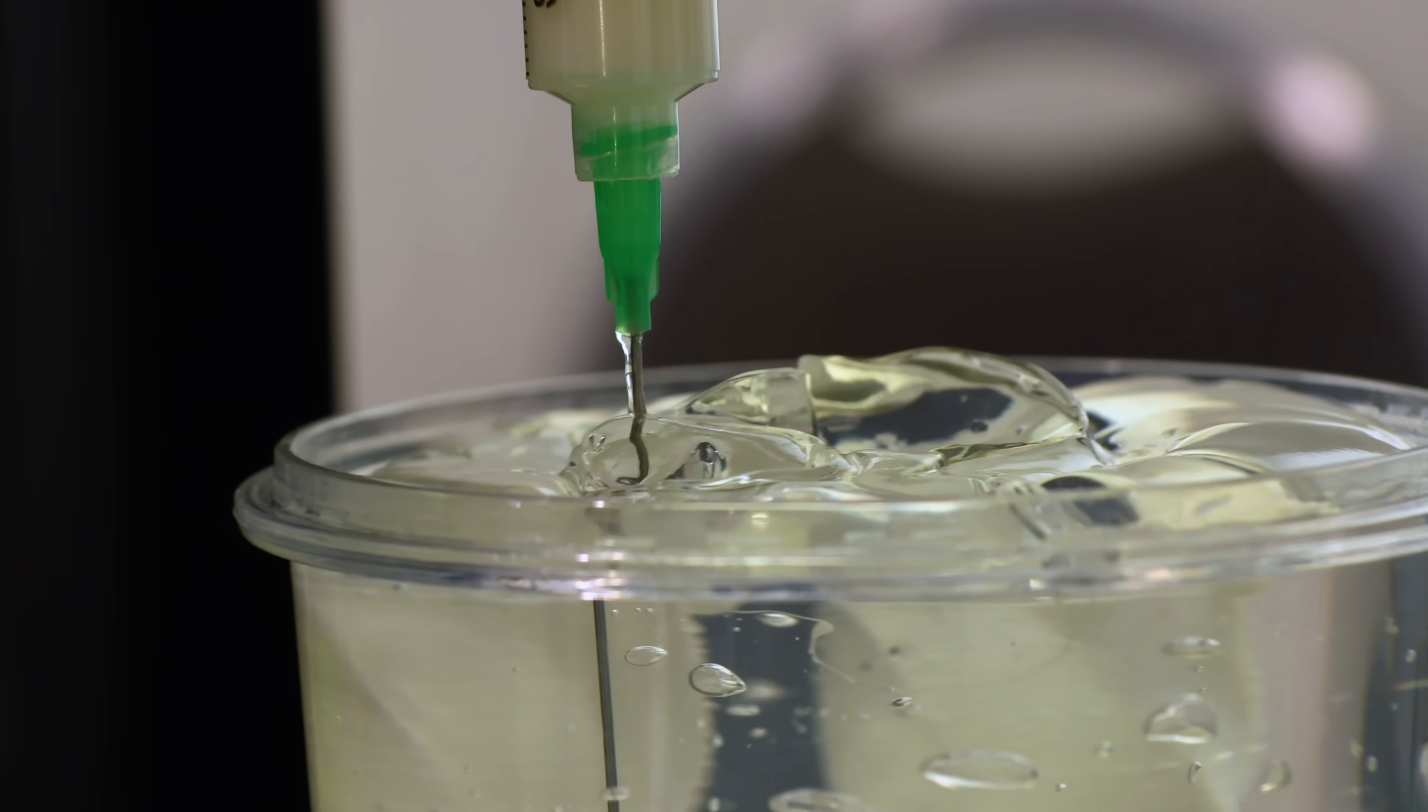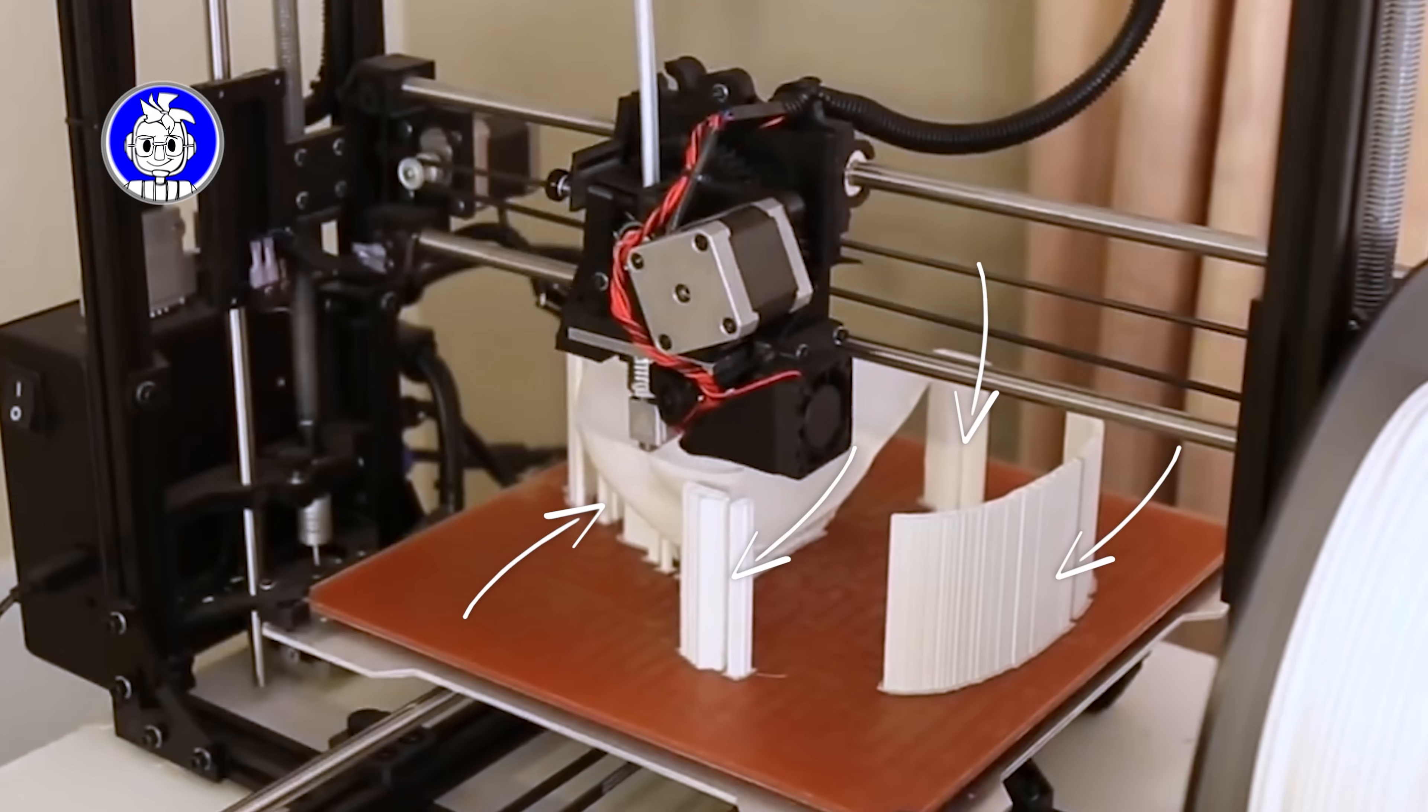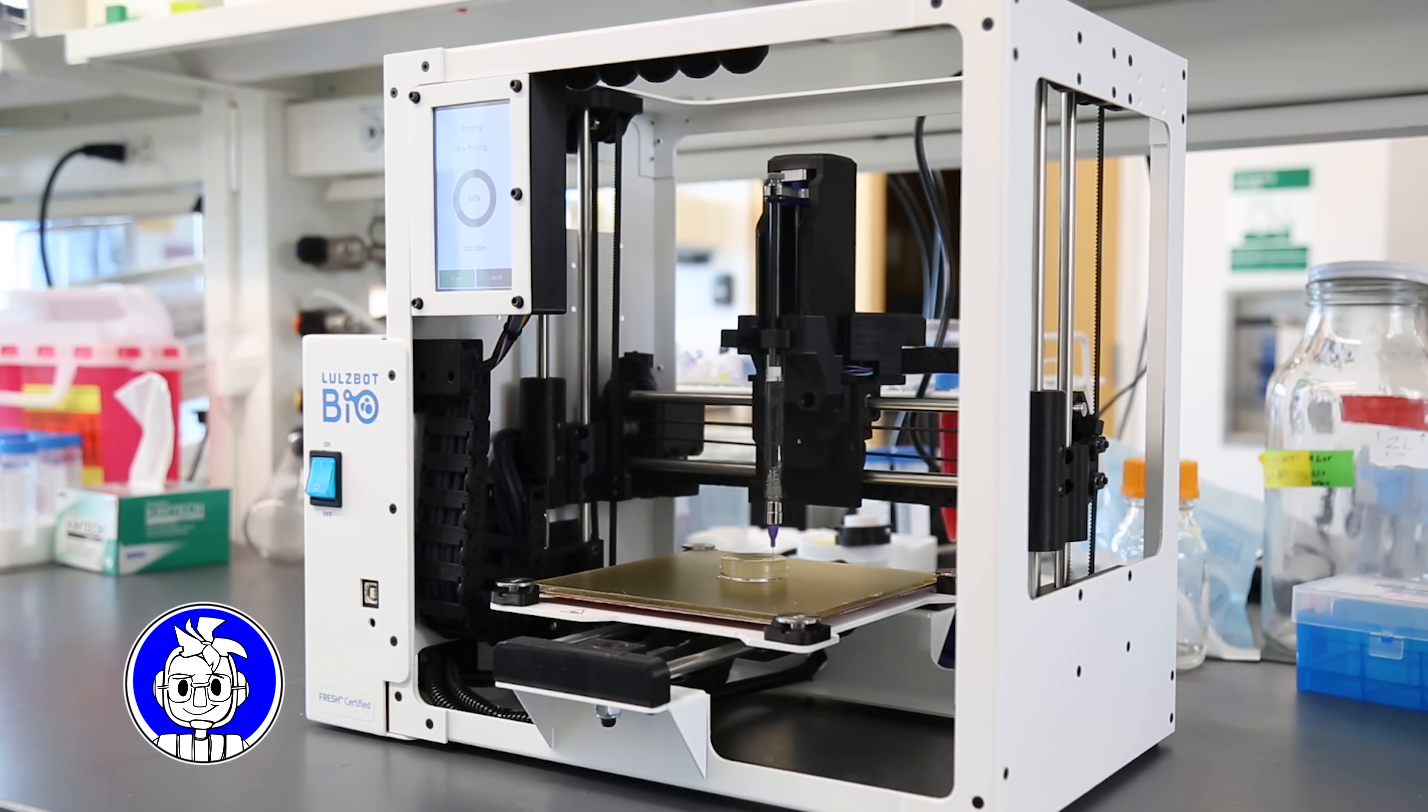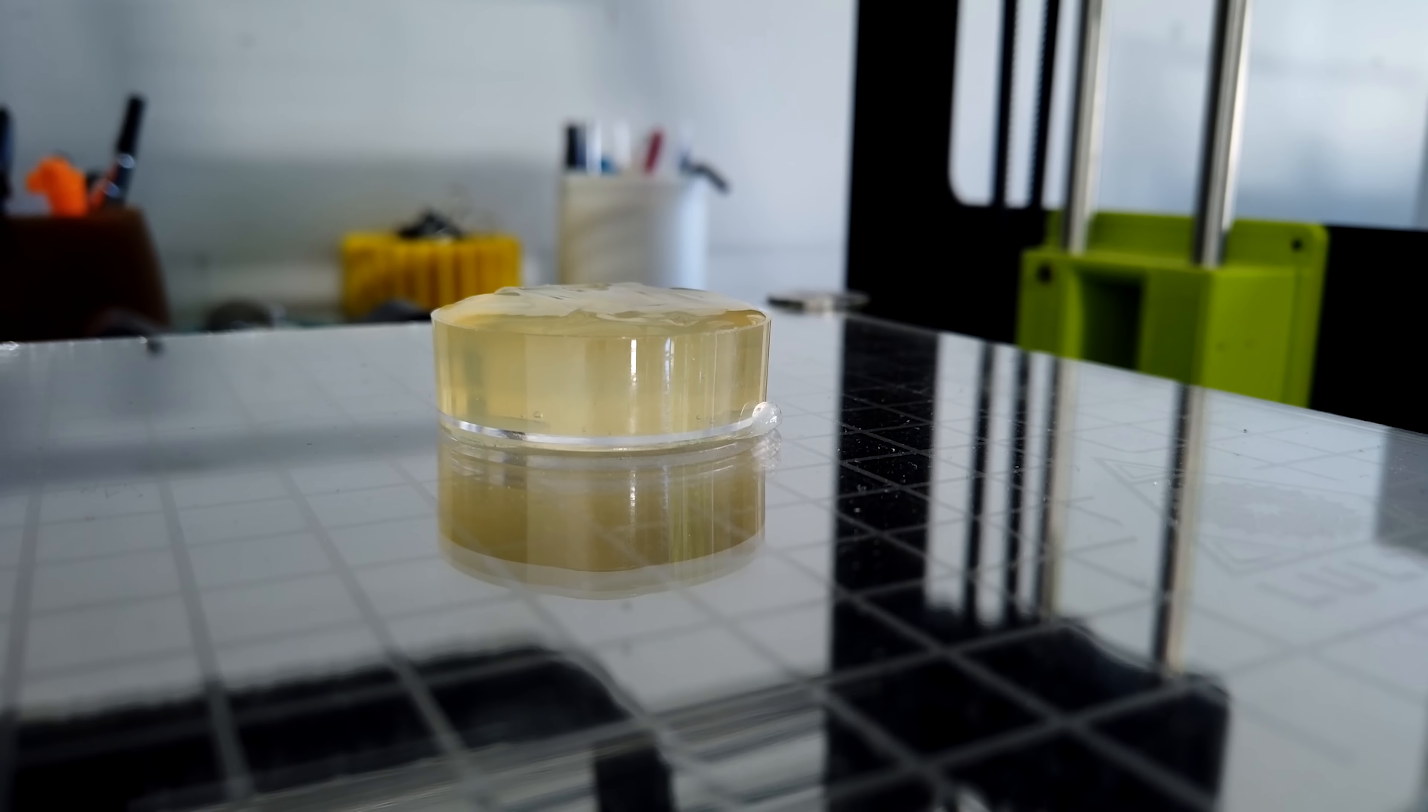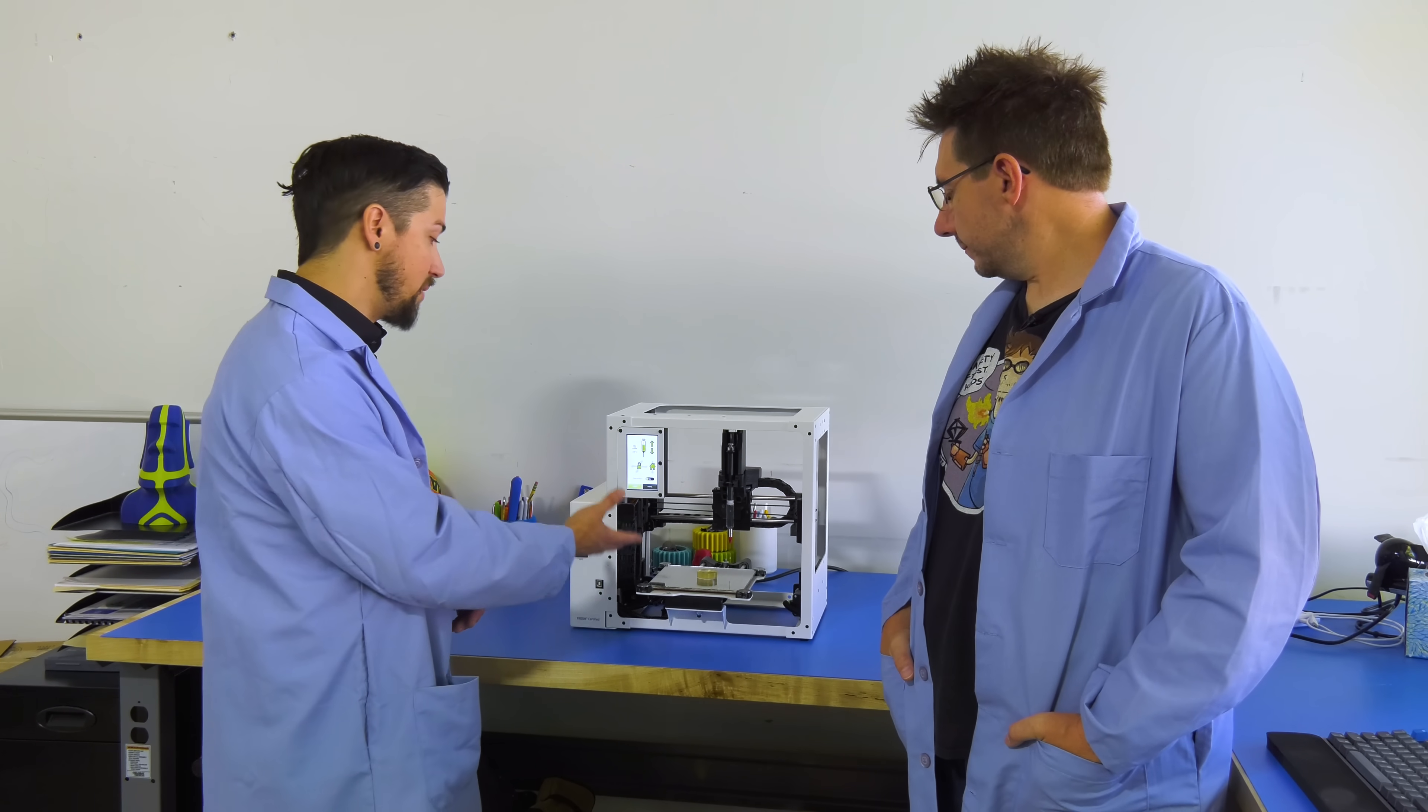So this life support material in this container, what actually is that? So life support is a microparticle gelatin. In traditional 3D printing, you have a support structure that holds your print as you're printing, while this holds your print as you're printing soft materials. Materials that would not be able to support their own weight and open air. So you print into the gel, and then you can cure it through photocuring, chemical curing, or even just heat curing. And then you heat up the build plate, and it will release the print. It turns back into a fluid, and you have your soft print at the end of the process.